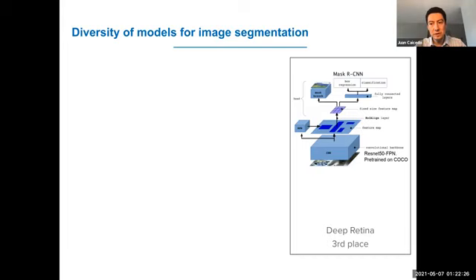It's kind of good to see that, reusing computer vision techniques properly, you can achieve high accuracy for cell segmentation as well. Many other teams used this same architecture, but they were not able to make it work as accurately as this specific team. So that also tells us that it's not just about the architecture, it's also about the way and the rigor with which you run cross-validation experiments to make sure that the algorithm is working properly.